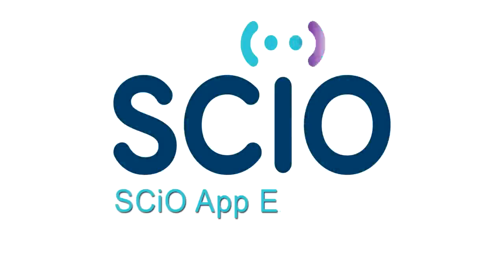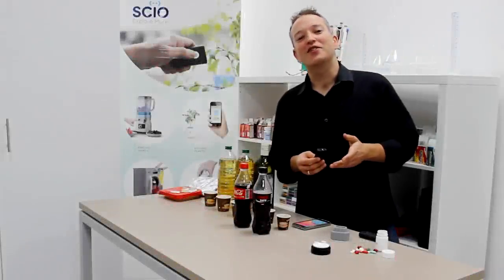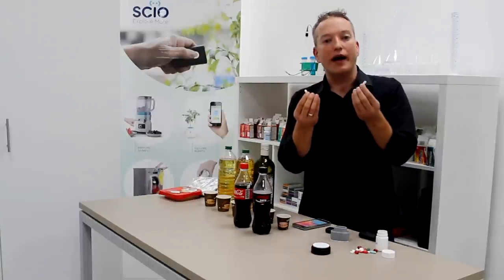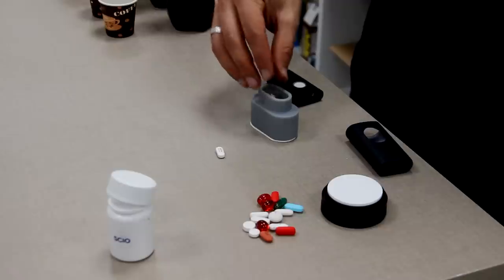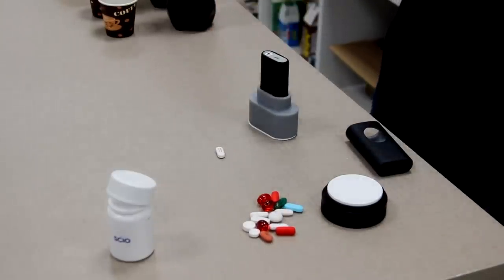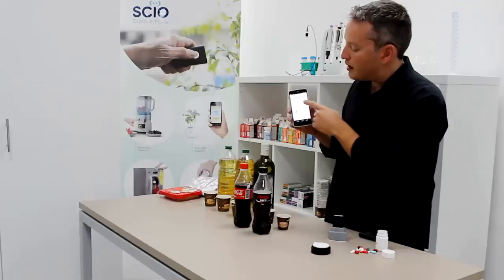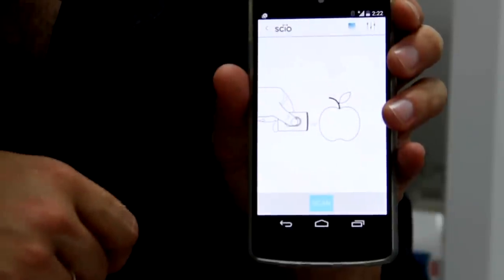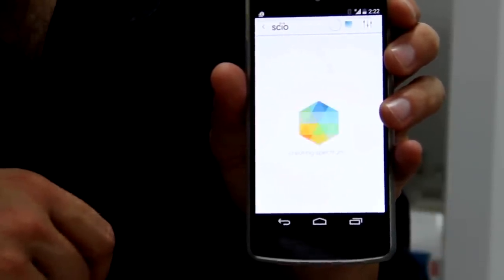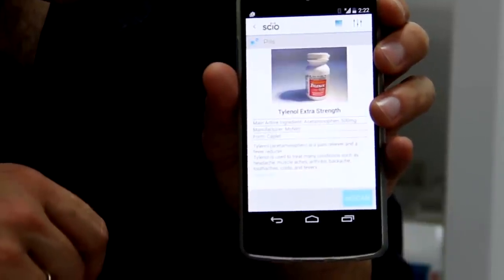So let's give it a try. The first thing we're going to try is scan pills. I have two pretty identical pills, they're both white. I'm going to drop one of them into the capsule holder right here, place the sensor right on top of it. Then I will launch the app on my smartphone and select the pills app, and simply scan. And there it is - this is Tylenol.